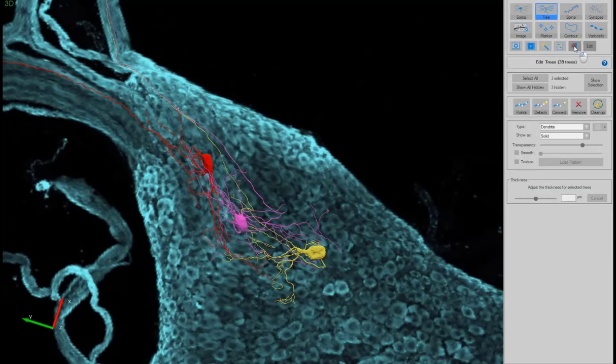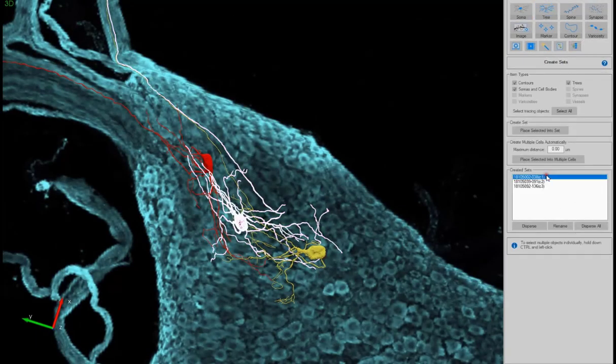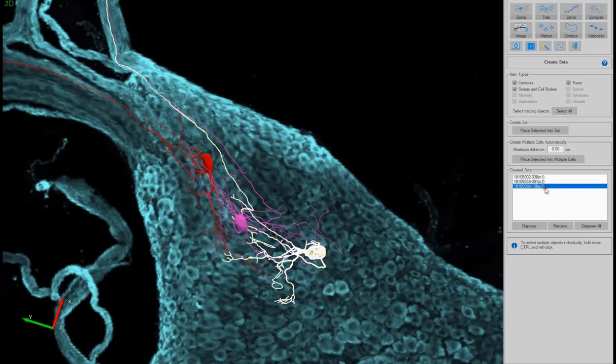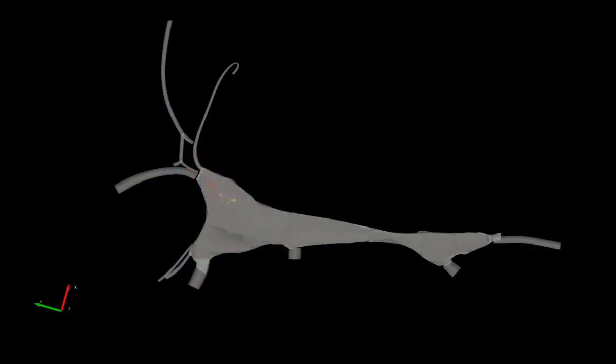By labeling the cells with the cell ID from the electrophysiological recording, the lab was able to link the physiological and morphological data to analyze the structure-function relationship of the cells.